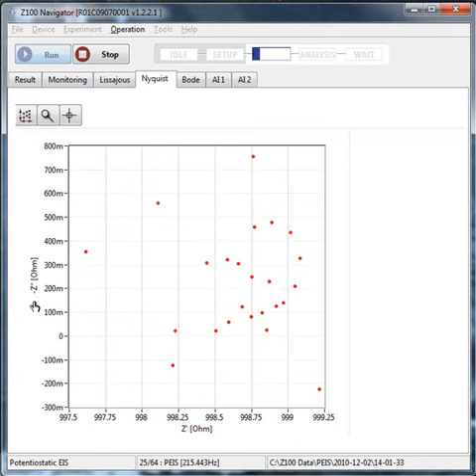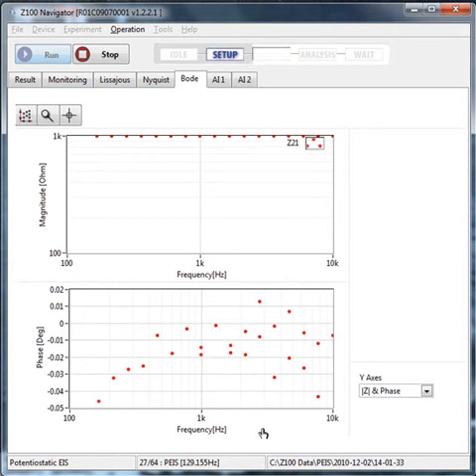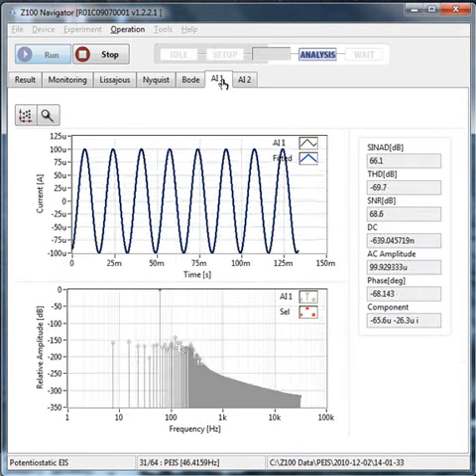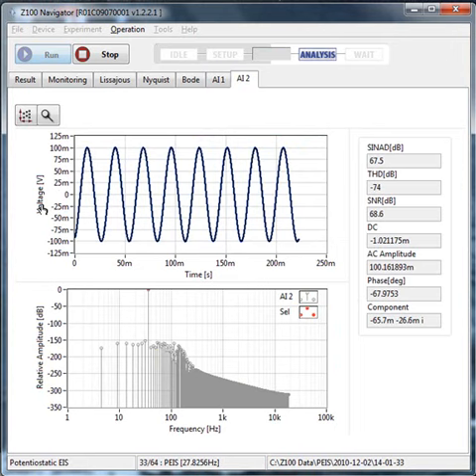The Bode plot shows the magnitude versus frequency. AI1 and AI2 display the current and voltage AC and DC values.